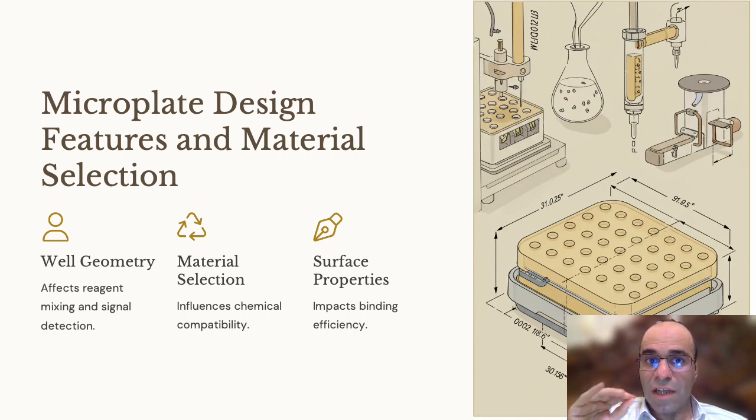Specialized coatings like streptavidin, polylysine, or collagen create functionalized surfaces for targeted applications and can dramatically improve signal to noise ratios. Modern microplate manufacturing techniques allow for customization of these features to match specific assay requirements. Selection should be guided by assay type, detection method, and target analysis.